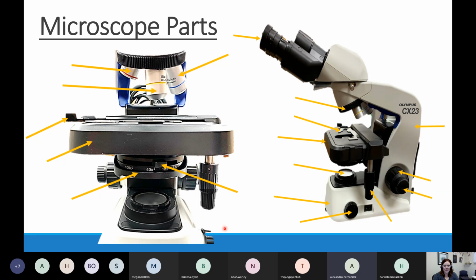So I suspect Noah is asking about this knob down here, if I'm interpreting correctly. Can I ask my friends in the chat to help me out? What did we call this knob down here? Do we remember? I talked about it kind of fast, so let's see if anyone caught it. Yeah, so here's that light adjustment knob. That's this one right here, the light adjustment knob that rolls backward and forward to control the amount of light.